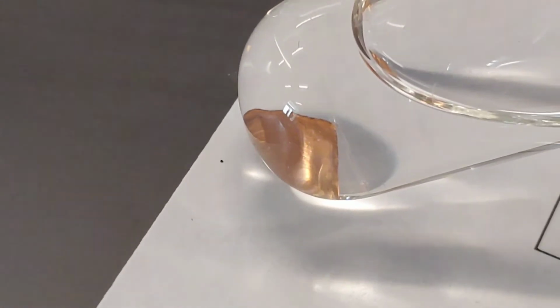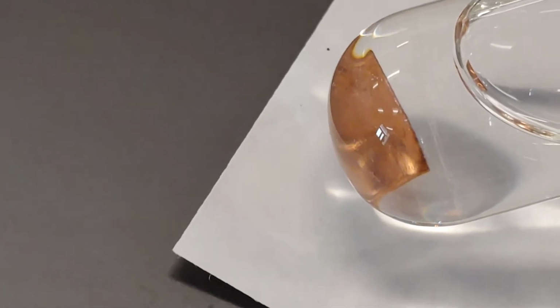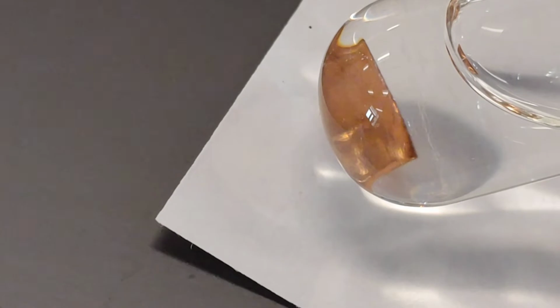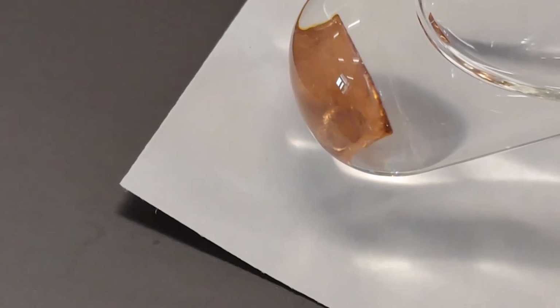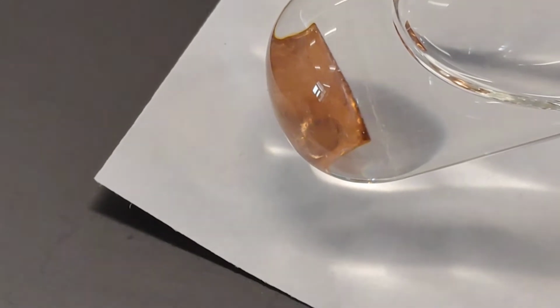Let's move that over here. See if you notice any changes to the surface of the copper. Okay, we'll come back to that one too.